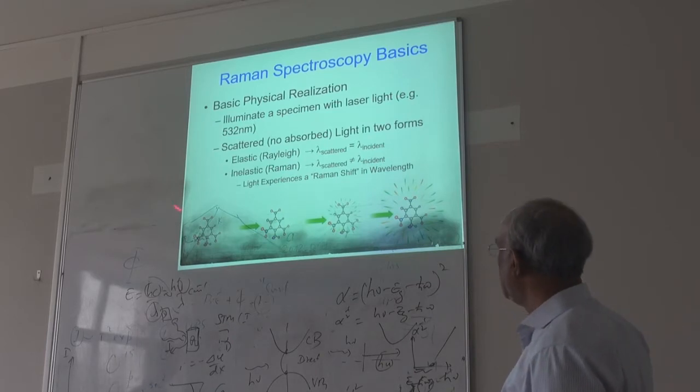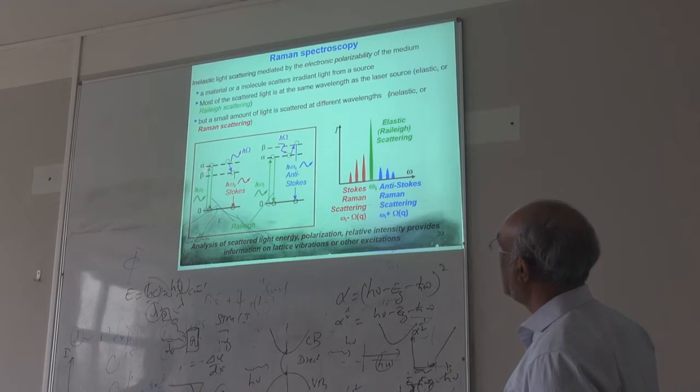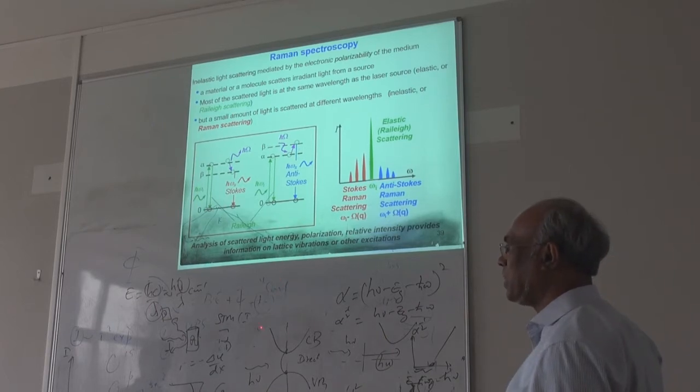So here are typically the vibrations. You can see there are two kinds of Raman. It's called the Stokes. So if you excite, and then the same thing comes out, we call it Rayleigh scattering, right? There's no change in your frequency.